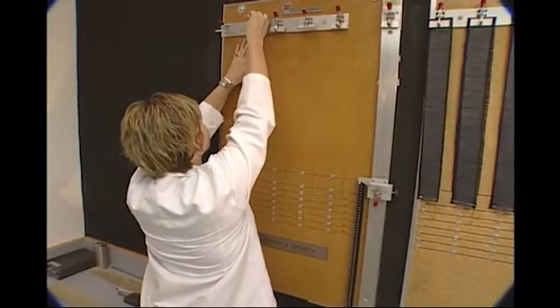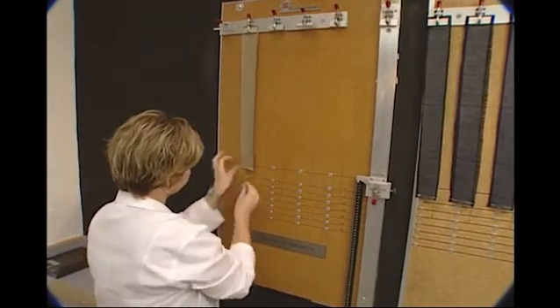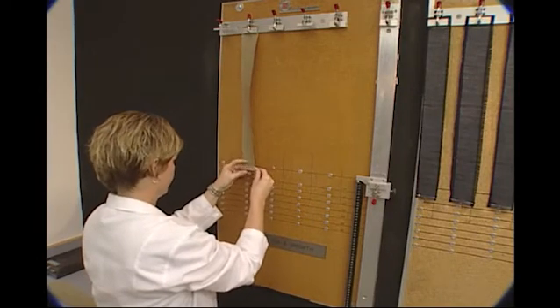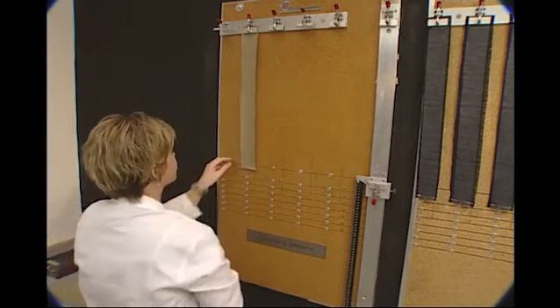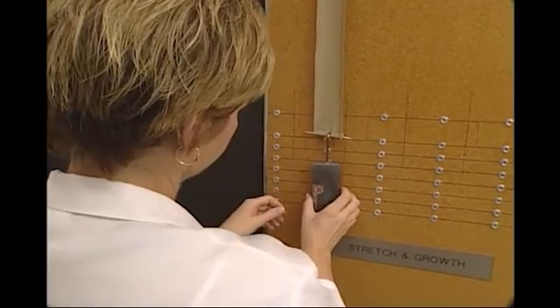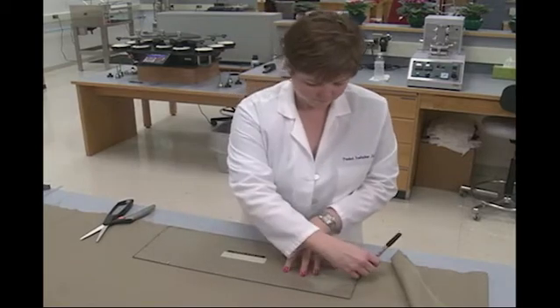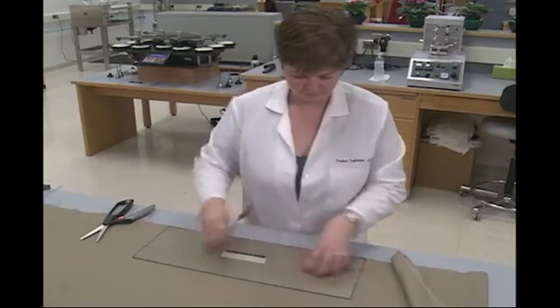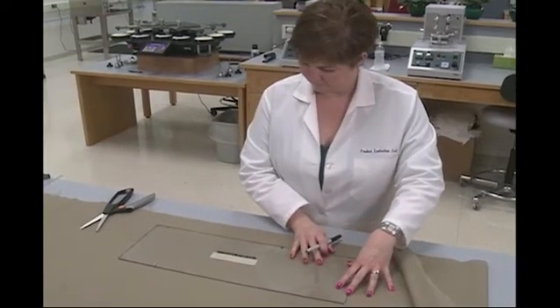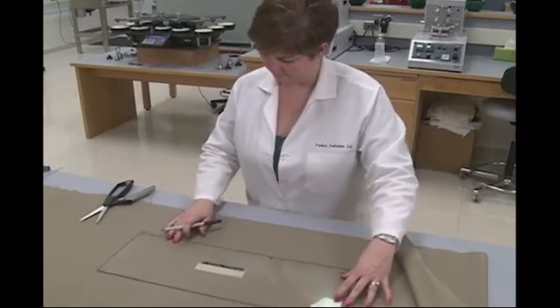The apparatus for testing woven stretch is a board that has sets of fixed clamps at the top, with the lower part of the board having mechanisms for allowing a test specimen to be locked into a fixed extension after weights or tension are applied. Whereas knitted fabric stretch specimens are made into a looped configuration, woven specimens are single-layer strips. 6 22-inch length by 2.5-inch width specimens are used.